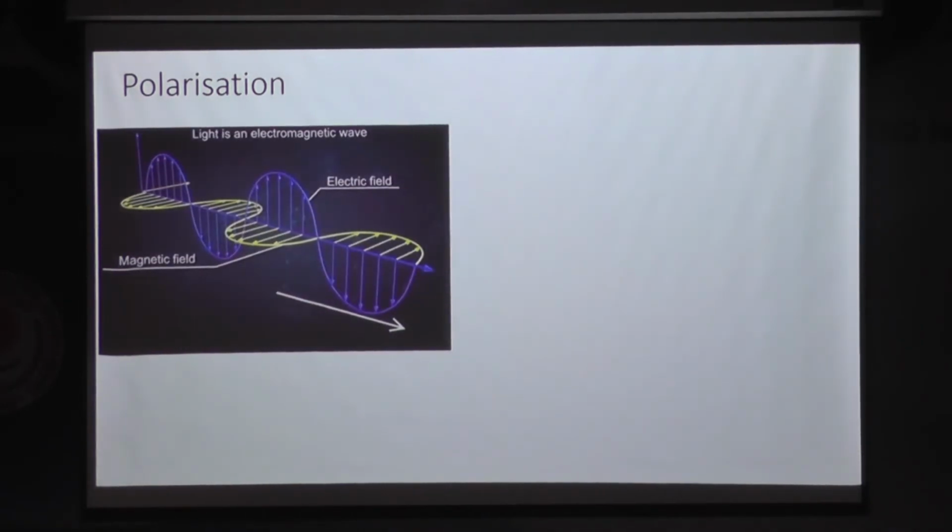It is like when the light propagates. It propagates in one direction, but it has two components with that. That is, a wave is in electric field and also magnetic field. So this yellow oscillation is magnetic field. This blue oscillation is electric field. So when we take the magnetic field out, that is not of our interest. Our area of interest is electric field.